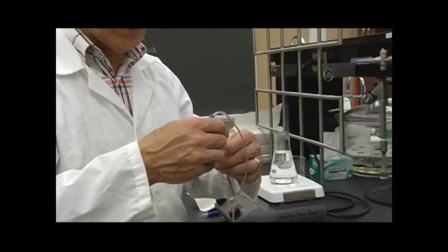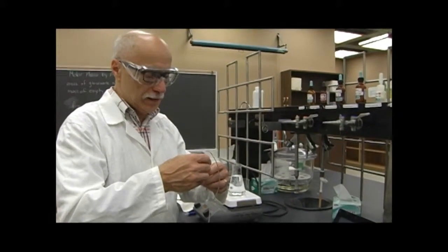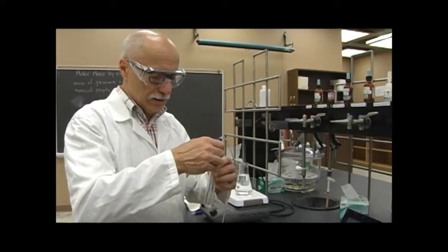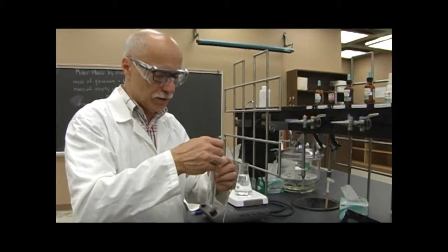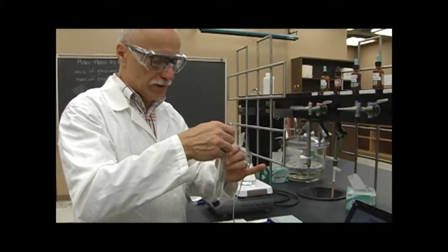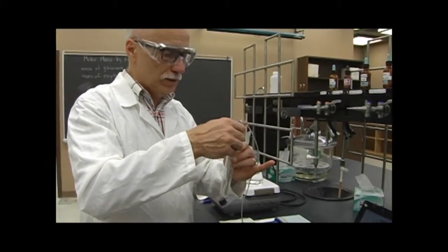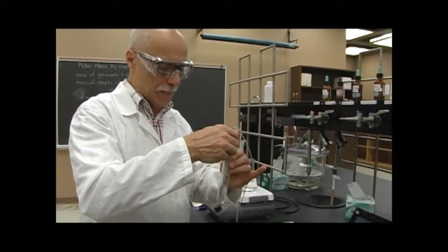We'll keep stirring it until we get a constant temperature. And according to the science, the freezing point of the solution should be lower than the freezing point of the pure lauric acid, which in this case was 43.5. So we'll also be looking for the slush point as to when we first see the solution freezing up.